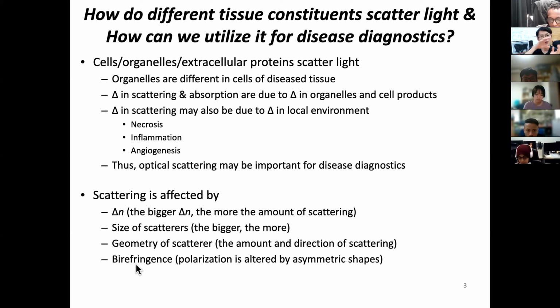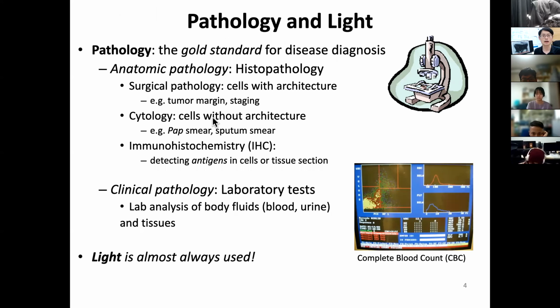For example, your colon tissue has multiple layers, and with that, it has a very specific organization. When a colon cancer or tumor arises, these collagen layers and the structure of these surface layers are disrupted. This is a very good target for polarization sensitive imaging, which actually shows quite different contrast. So that's something I want to remind you of, why biomedical optics can be a very interesting, good tool. So let's look into pathology.